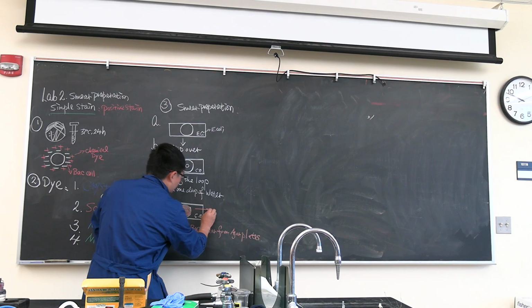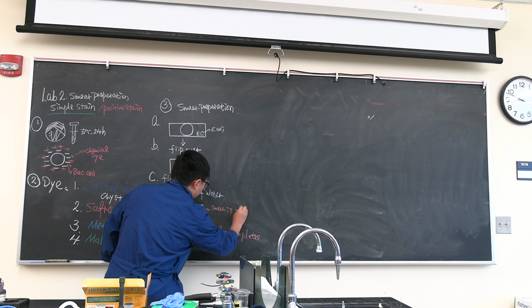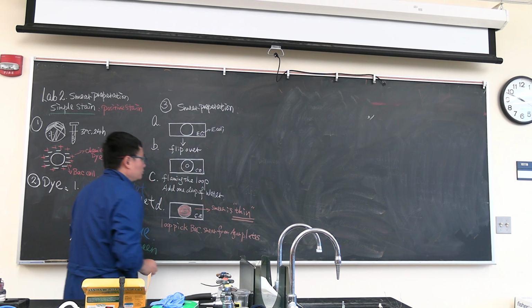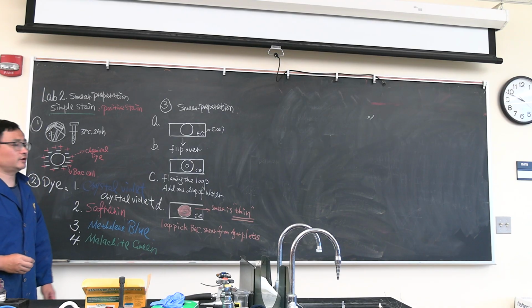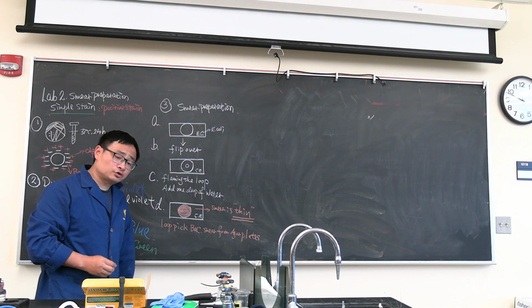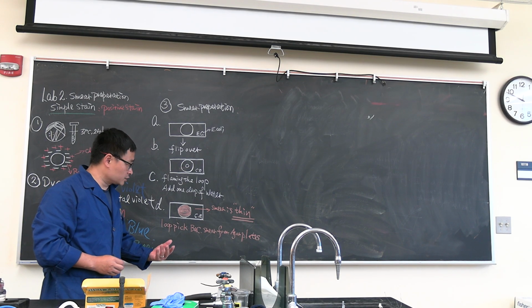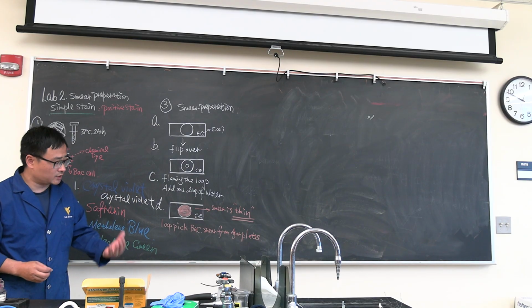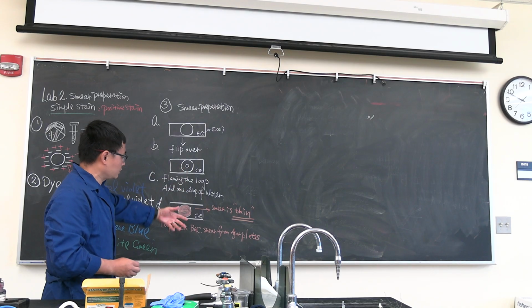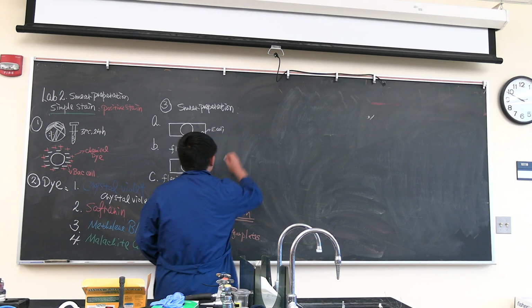Make sure this smear is thin. This is important. We don't want a very thick one, because we would love to see the morphology and also the arrangement of the bacteria. So make sure the smear is thin. Okay, you have water, you have a bacterial smear. We're going to move to the next step.